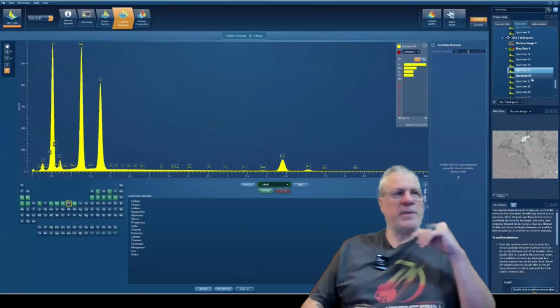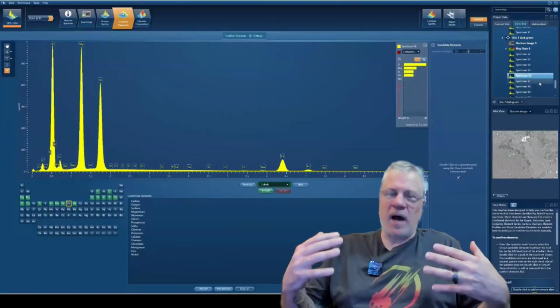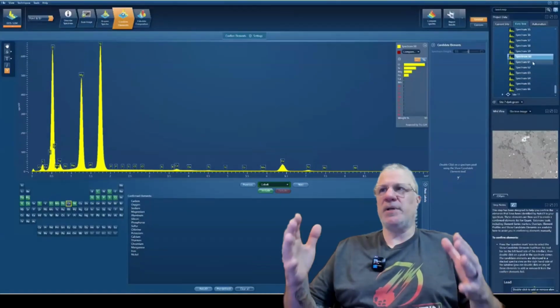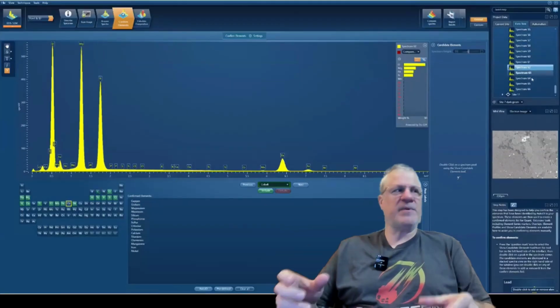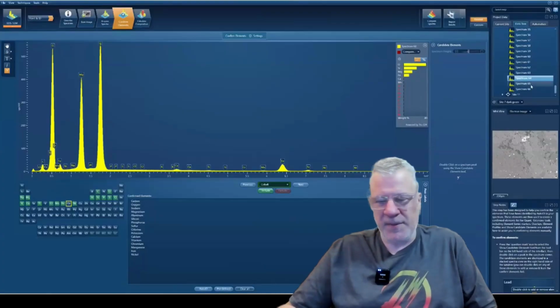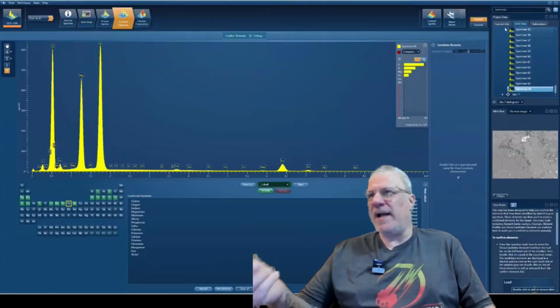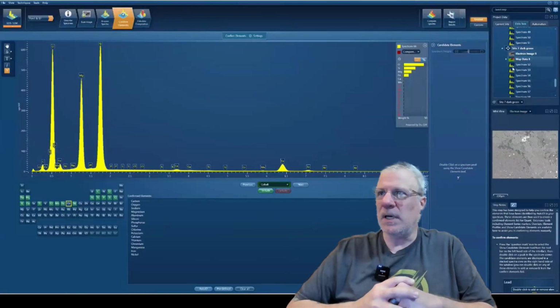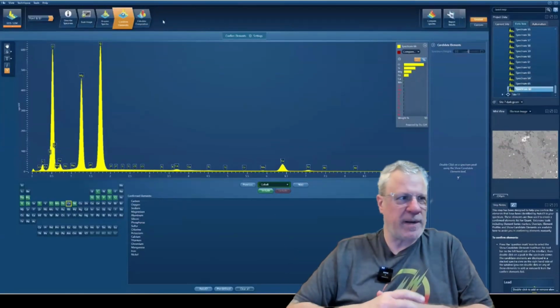Wow, that's really cool. So a classifier of iron meteorites will be using a different tool set than you, because you guys are really looking for the different elements at a different range, and also with the metal, I would imagine they're so similar in how they react that they would overlap each other quite a bit.